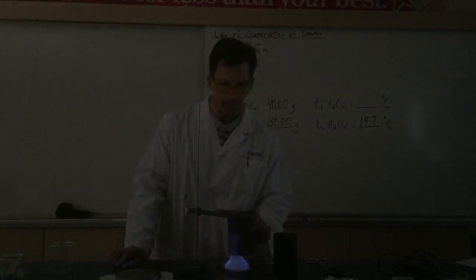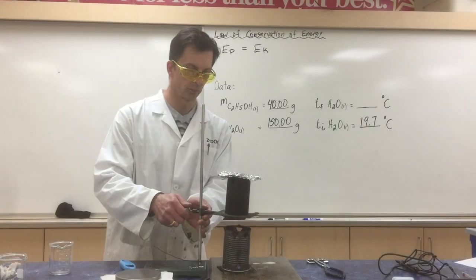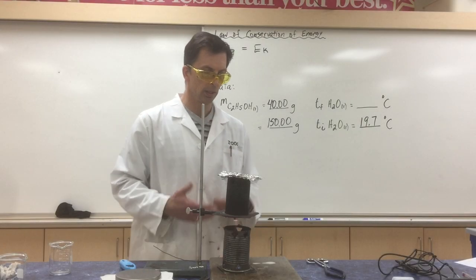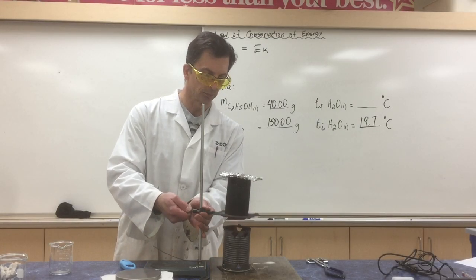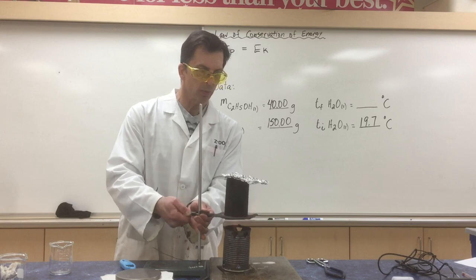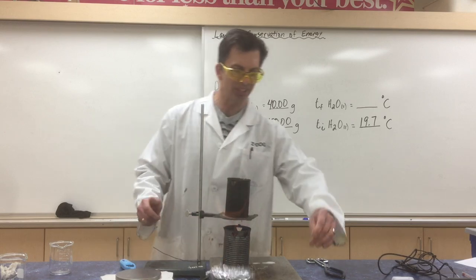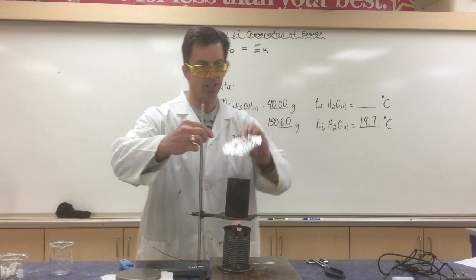Here you see the combustion of the ethanol gel. Our fuel is combusting. You can see we have some experimental error with the lid wanting to fall off here.